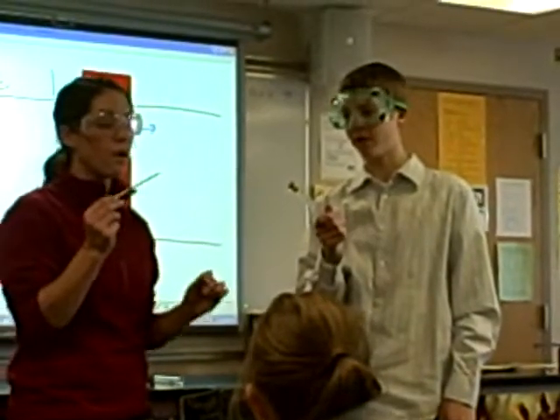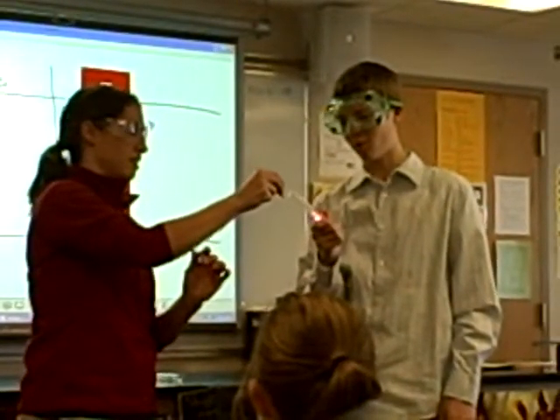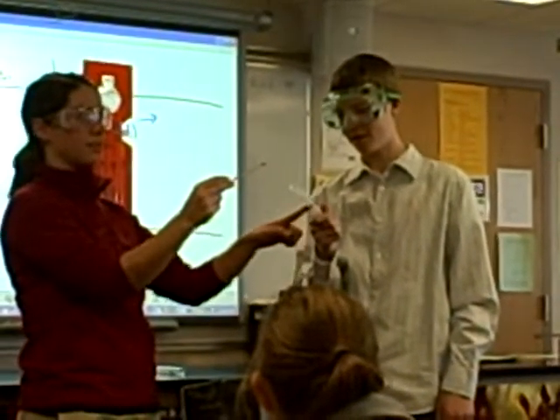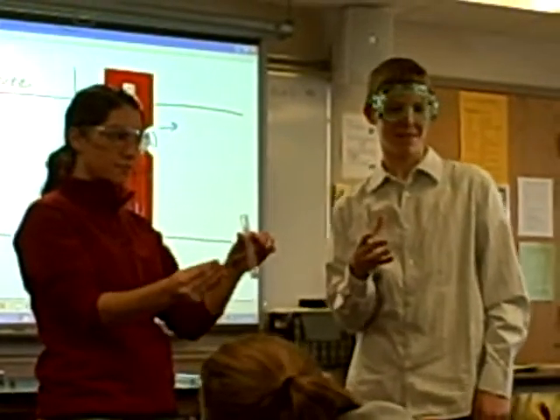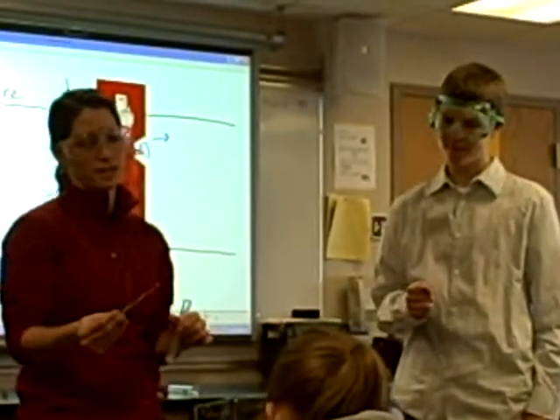Okay. It smells like fire. Whoa. Don't drop it. Oh, it didn't quite relight, but everyone saw it glow brighter? Yeah. Okay, so write that down. Glowing splint glowed brighter, it almost relit, so that proves we have oxygen gas.